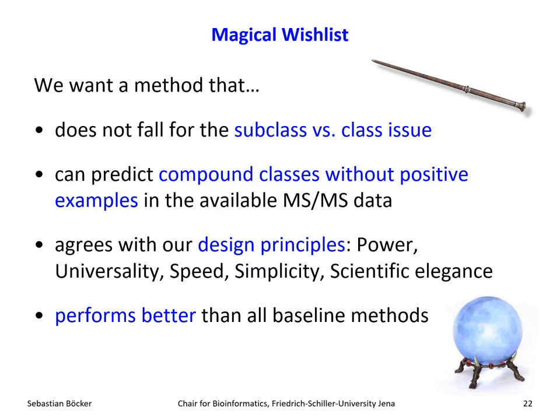Then obviously our method should follow the design principles which I mentioned in the beginning. And then it should also perform better than anything out there. And in this case, because there are no other methods available currently, except for direct prediction variants and one other method that I will mention later, which is also just a baseline method, it should at least perform better than these baseline methods. Okay? On top of everything else, it should be magic and perform better. Because for example, direct prediction performs quite well in practice because you never notice in your evaluation all of these issues. They simply don't happen there. If you have no spectra, you cannot evaluate a predictor. Oops. Okay, how can that happen? You really have to dig for it to see that these bad things are actually happening. So we want something that gets around all these issues and then in the end is also better than everything else.